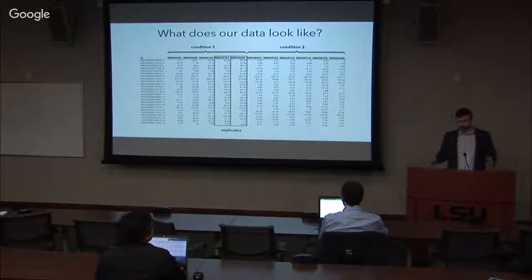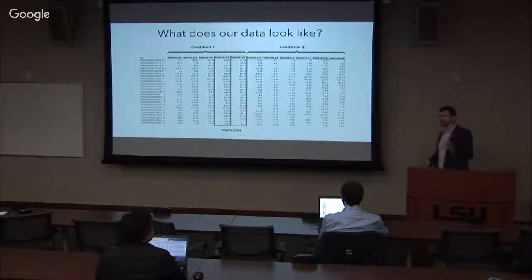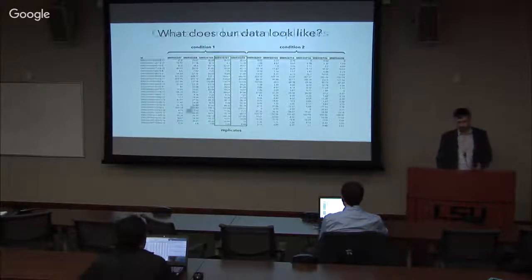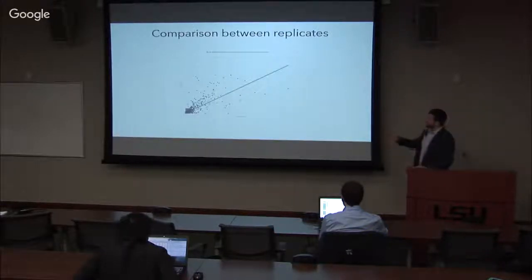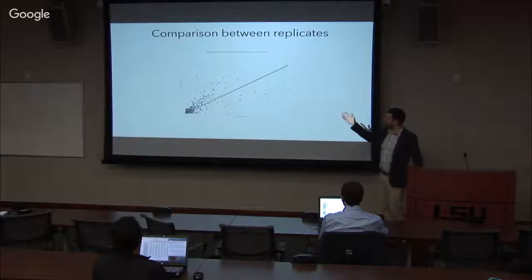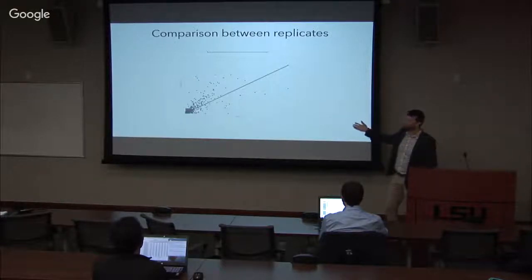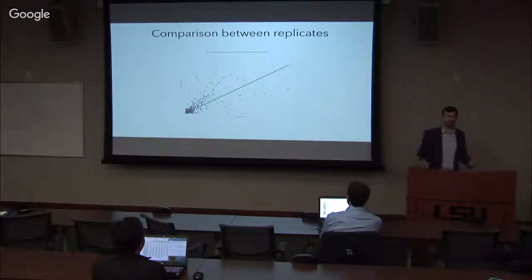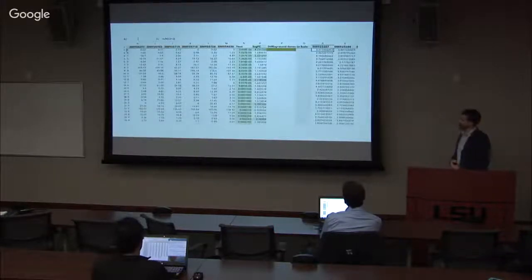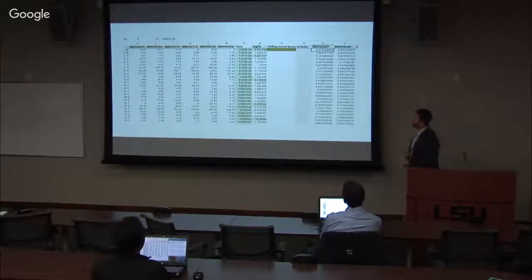Therefore, if you were to map how the same gene is expressed between two such samples, you're expecting them to be fairly similar, right? So you are going to expect that all of the values are distributed along this line. But in this case, this is FPKM data, and you can do this yourself, it looks nothing like they're correlated, right? So we're making a wrong assumption here, thinking that they are replicates. Because of that, a standard step before going further is to use a logarithmic scale.